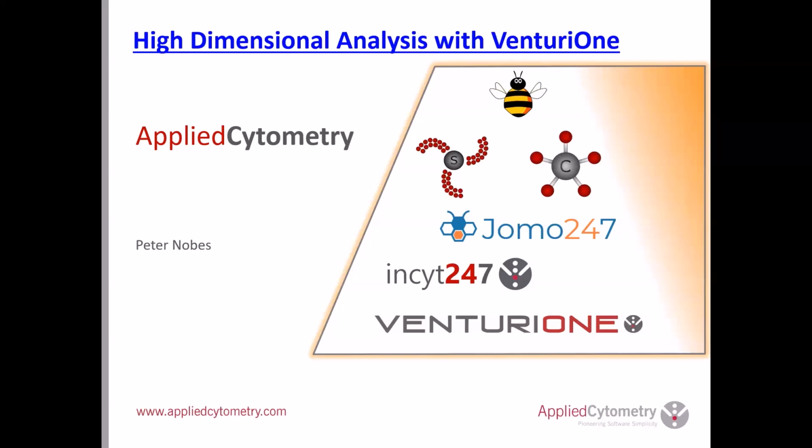And what we'll be doing today is to look through how we can do high dimension analysis with VenturiOne and some of our associated products.